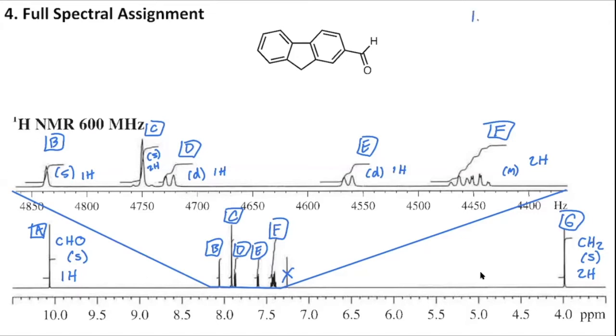It can be on the slides, it can be on a separate piece of paper, whatever works for you, to say, oh okay, when I looked at this proton data, these are the observations that I made or conclusions that I came to. So I noticed this peak was 2 hydrogens at this ppm shift, and it was a singlet, so that means no neighbors.